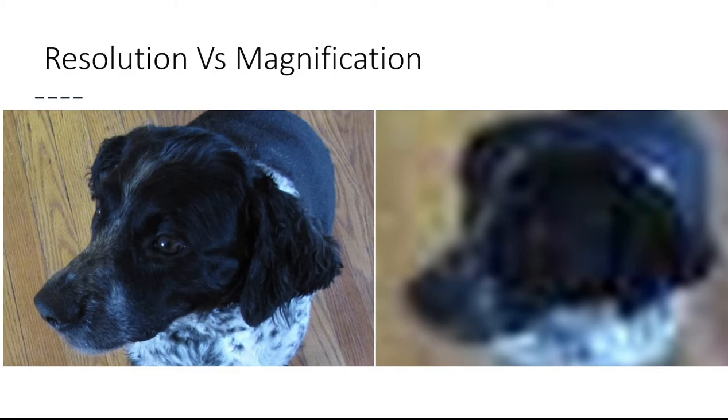In this row of images below, we can see the face of a dog. You have what is described as high resolution. It's very clear. You can see a lot of the details, the spots, even the grain on the wood. Whereas with low resolution, you can barely make out the dog's face. With magnification, we zoom in and we can see a lot of the details a lot larger. So the eyes of the dog look bigger.